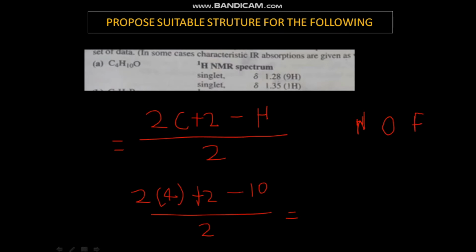For the halogens, that is fluorine members, if it is present, you have to add +1 to the hydrogen deficiency index formula. If it is oxygen, we don't want to do any correction, so the value would be simply 0. As far as the nitrogen family, the value should be -1.